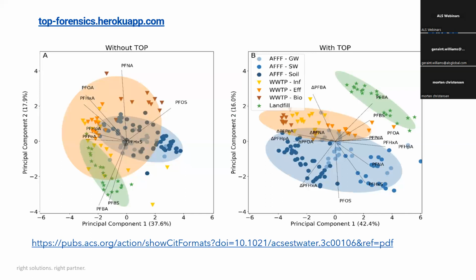I would say it's a preliminary line of evidence. Later on in the presentation, I'm going to talk about some of the other techniques which might be available to us, which give you a little bit more certainty of the data. So it's useful to be aware of these preliminary lines of evidence. But if you wanted more certainty, if you wanted to use a technique called high-res MS for legal cases, I think that would also be a useful option.